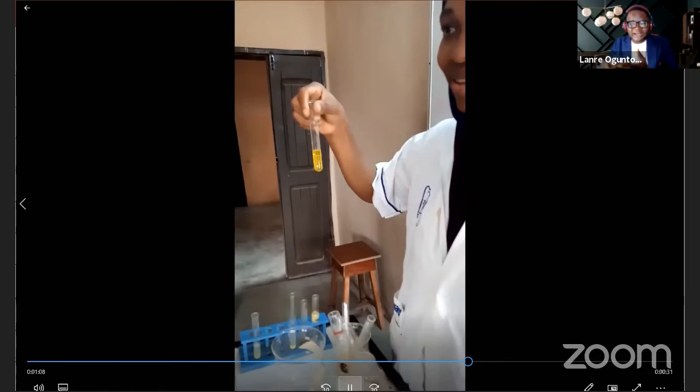you know, we have looked at the fact that your sample C is an organic solvent, right? And you saw that when we dissolve that iodine in your organic solvent, your alcohol, it dissolves. Remember this? When we dissolve the iodine here, it actually dissolves. So we need to write down the observation. Sample D in alcohol, it's definitely going to dissolve in alcohol, but it will not dissolve in water. Okay? So please, everybody note that down.